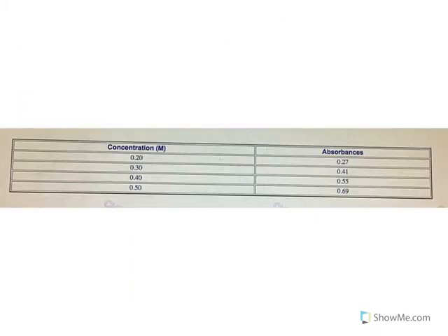So here we have some absorbance data. We have shined a light using a spectrophotometer through 4 different solutions with known concentrations, 0.2, 0.3, 0.4, and 0.5 molar, and we have their respective absorbances. So imagine we had an unknown solution, and we filled a cuvette with this solution, and we shined our spectrophotometer through it.